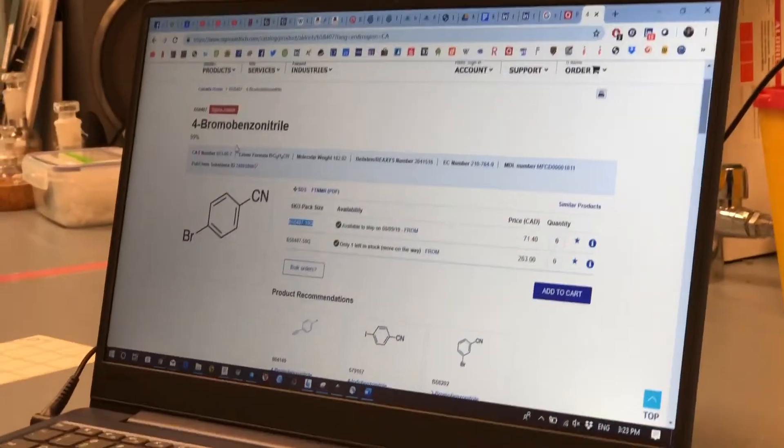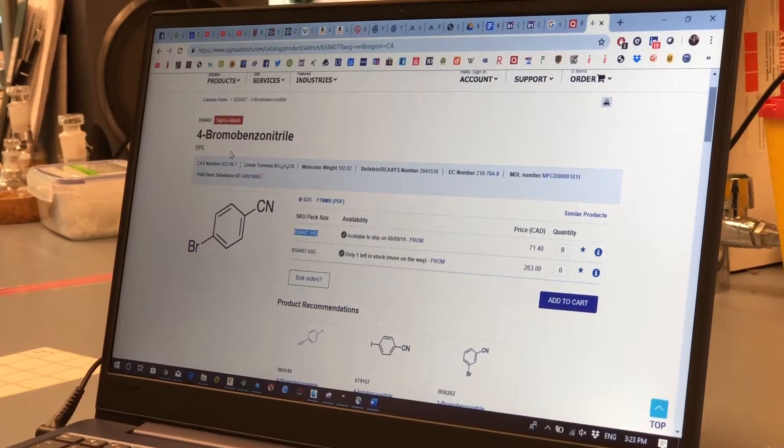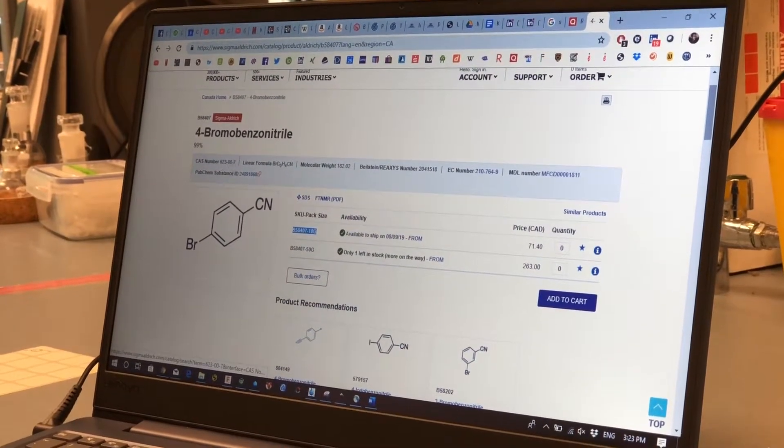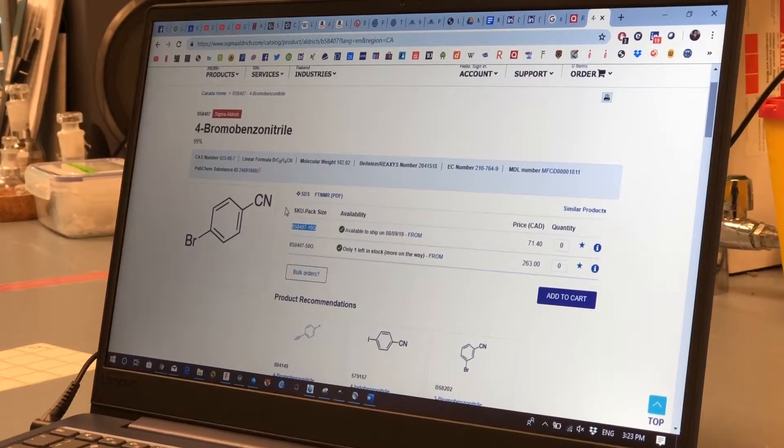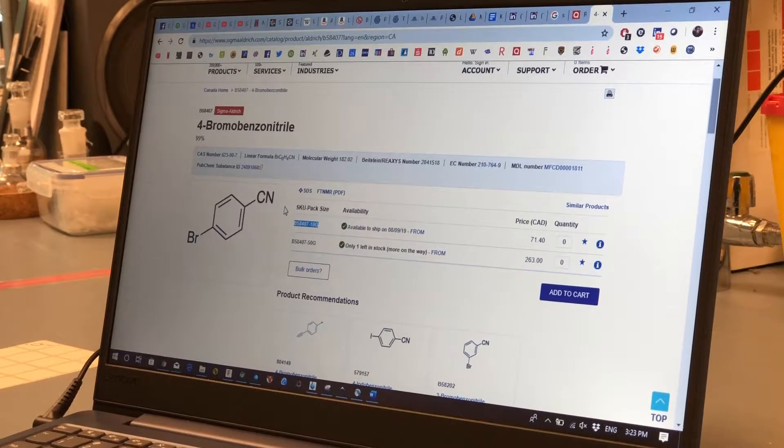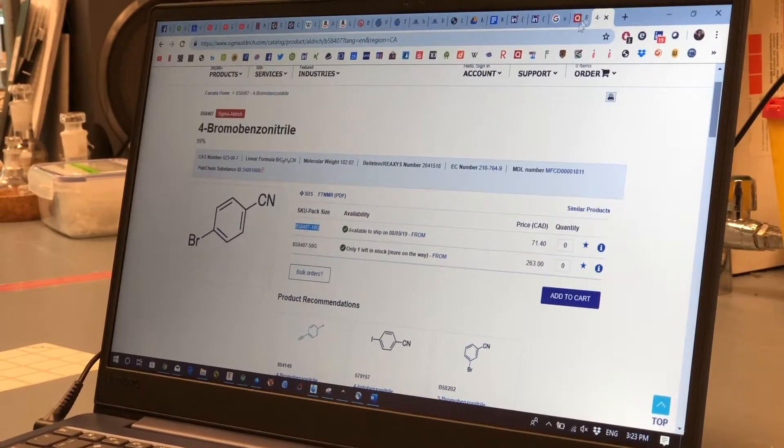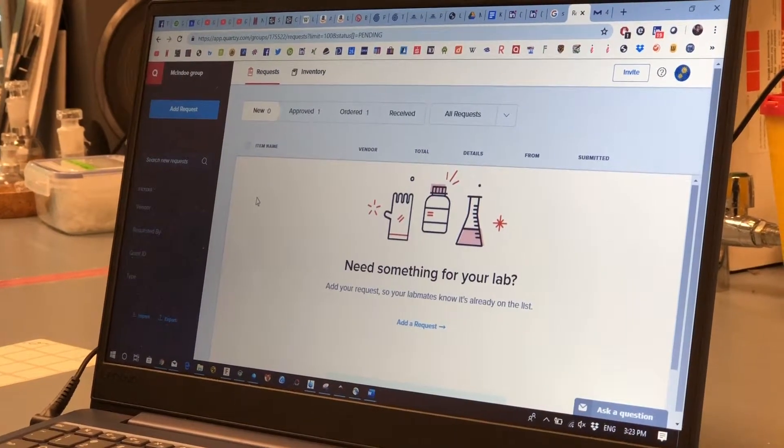So here we have 4-bromobenzonitrile. We already found that we can order it nicely through Sigma Aldrich and we actually use a browser-based program called Quartzi.